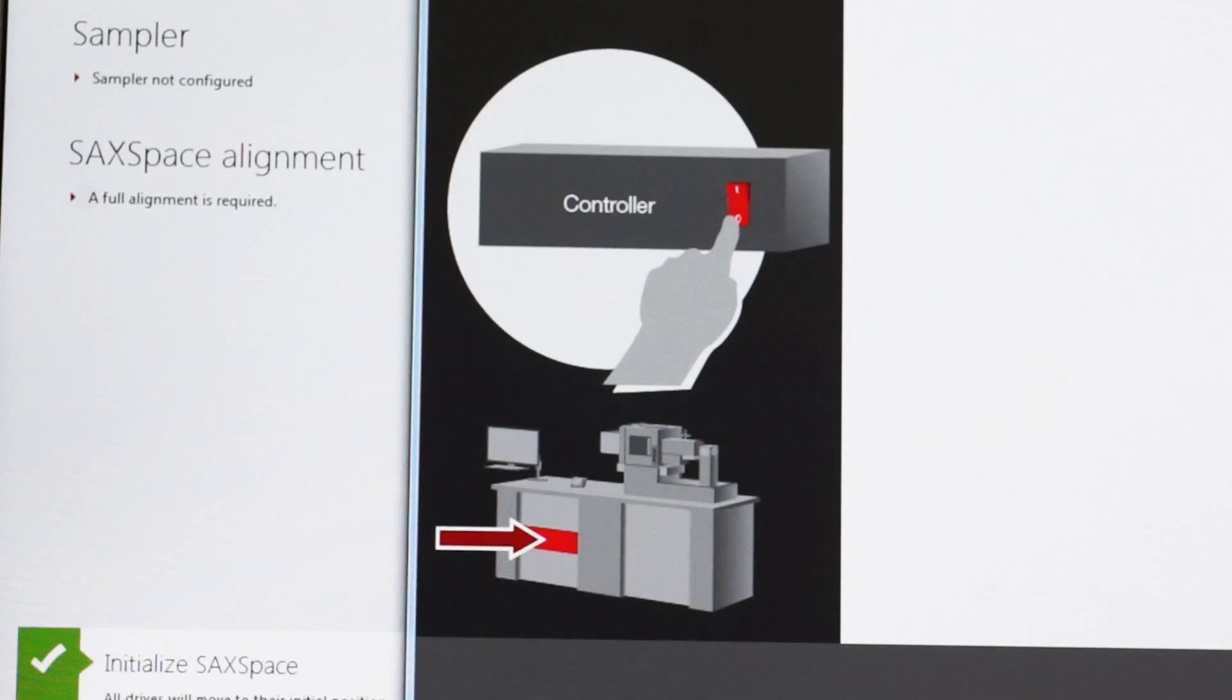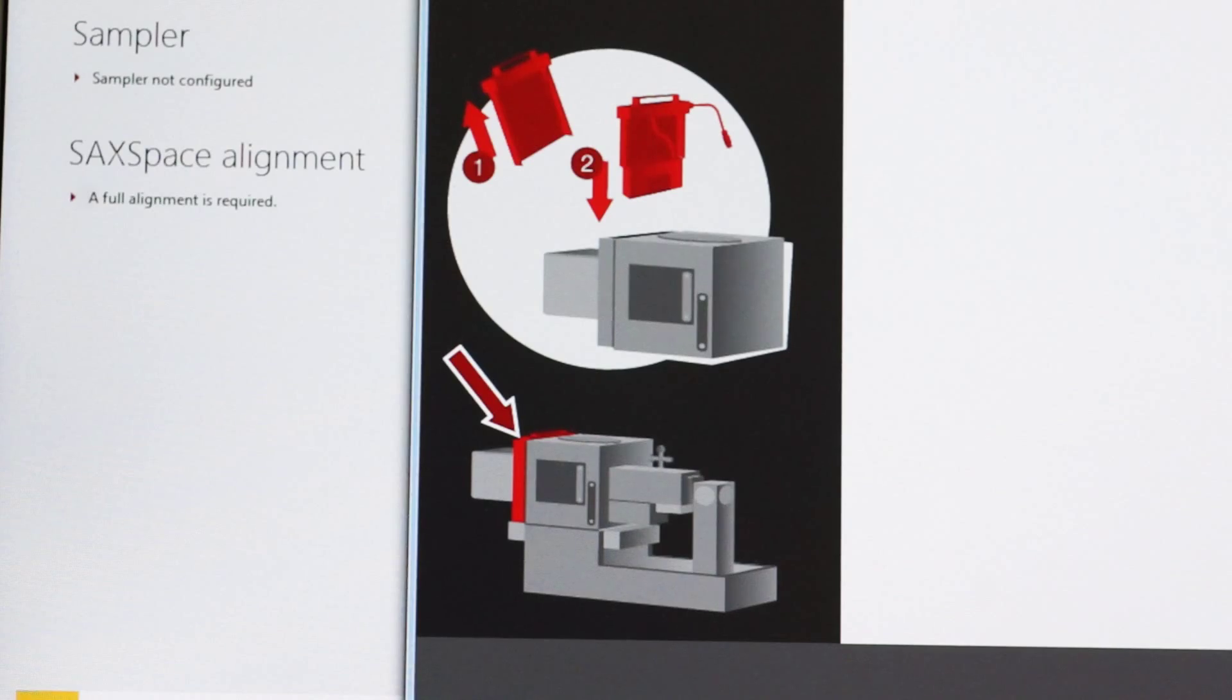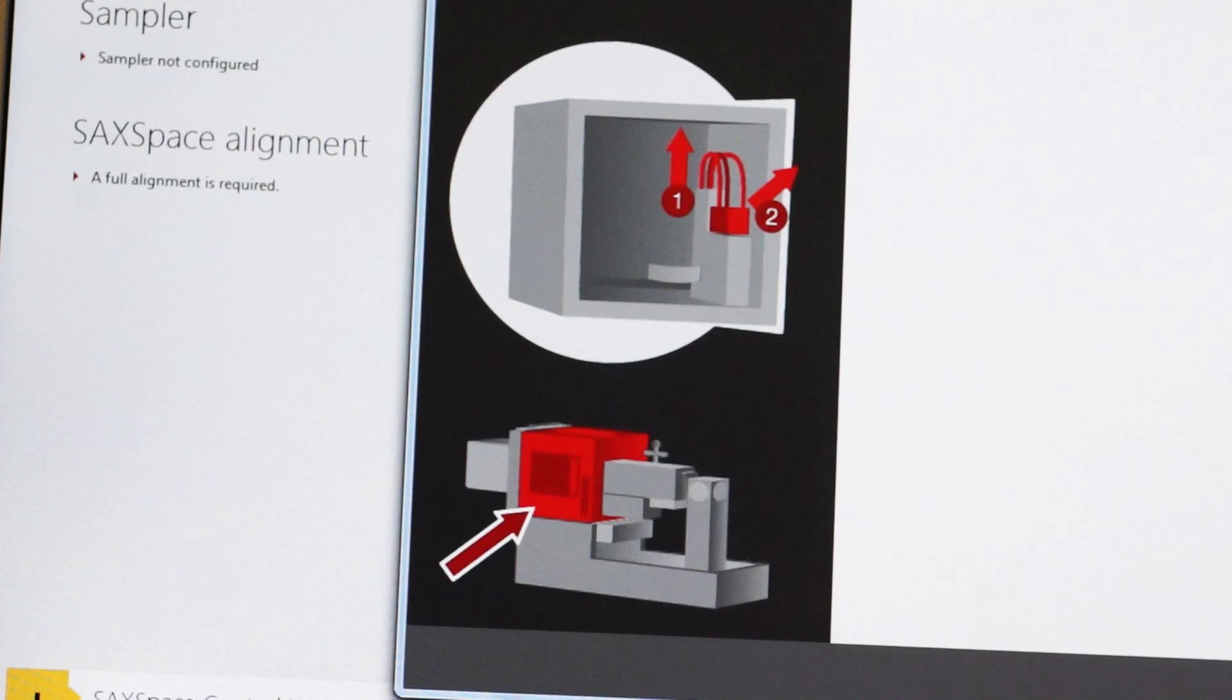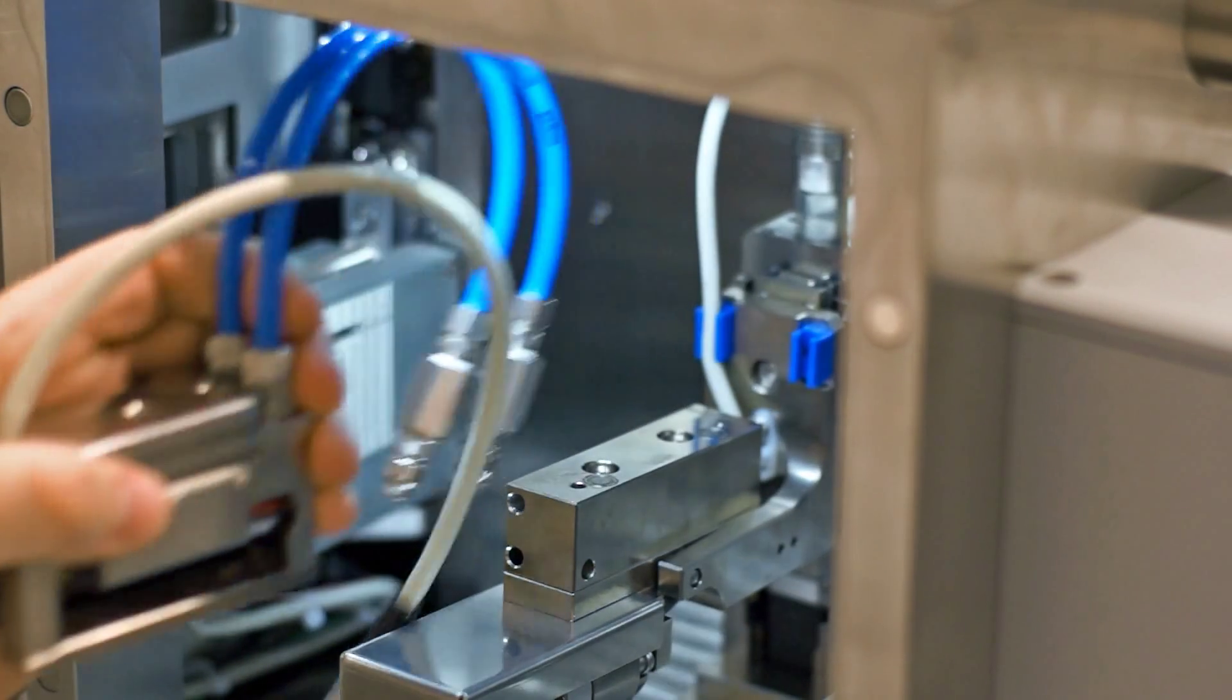An intuitive software wizard tells you what to do, step by step, in clear words and pictures. A few simple hand movements are all that's required.